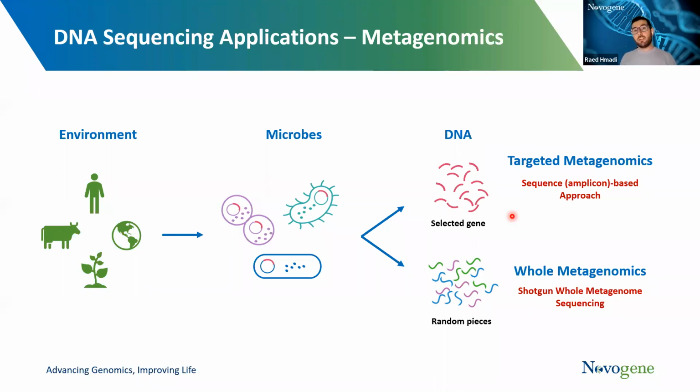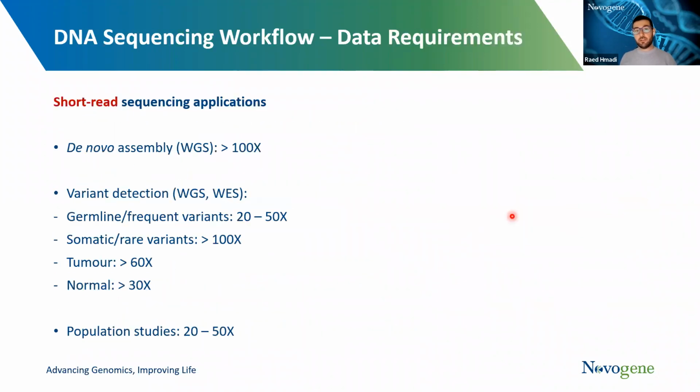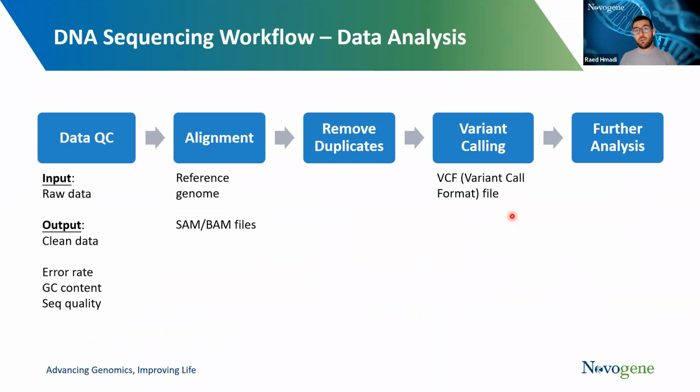But my recommendation here is to be very careful with PCR amplifications, because it can introduce mismatches, and then it can introduce some defects into the pipeline. And that has to be tackled later during data analysis. So these are shown here in this pipeline. So these duplicates that can come while we are amplifying the DNA. And we definitely need to remove them, because they can create a bias when we do the data analysis.